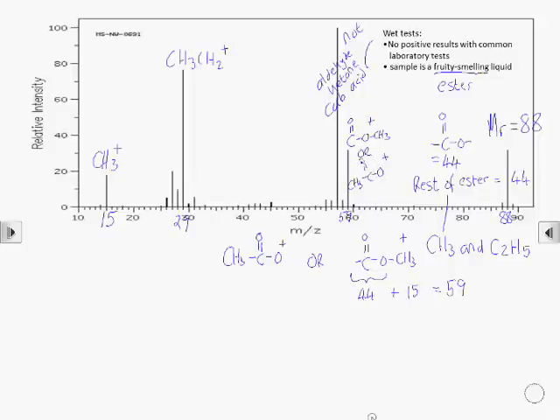We've got this very large peak at 57, which we haven't yet identified. We need to come up with some other possible fragments and match where they would show in the spectrum. We could see whether the oxygen and the CH3 group are connected together—an OCH3 fragment. That would show up at 31, and we do have a small peak at 31. So OCH3+ may well be a possible fragment ion.